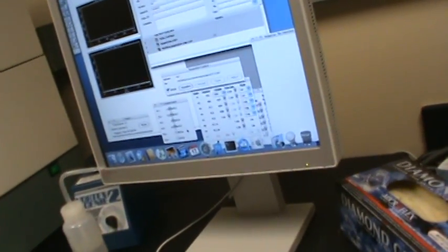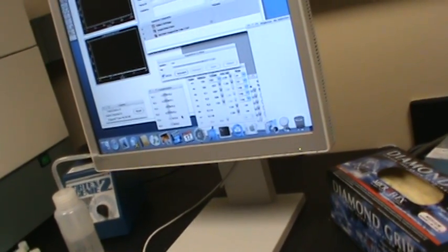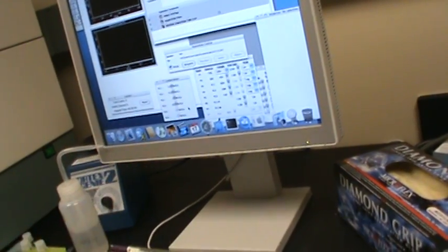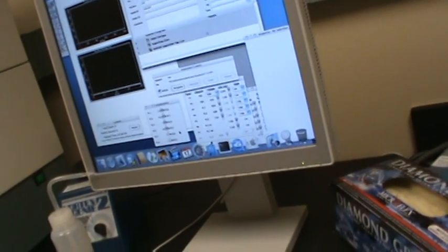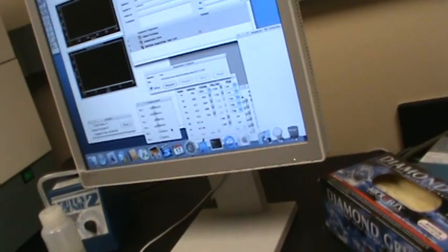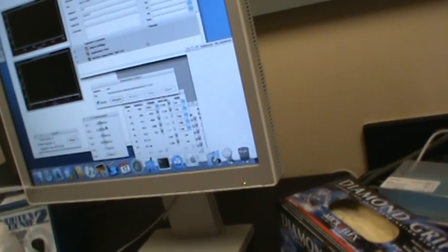Okay, yeah. But this is your basic setup, and this is how you get started running your instrument. I see. Okay. But you have to work with your voltage and your detectors first. And that is the hardest part. Yes. Okay. And once you work with it, you can save those instrument settings. Yes. Okay? Yeah. And next time I just load the instrument settings again and use it.